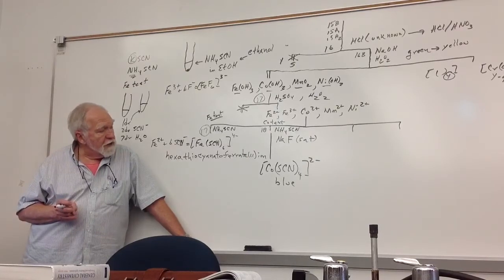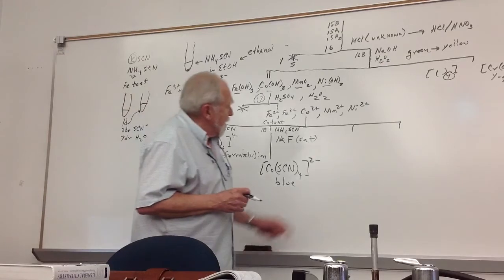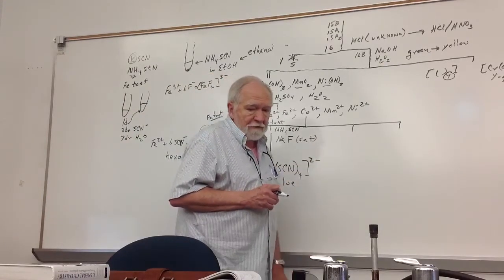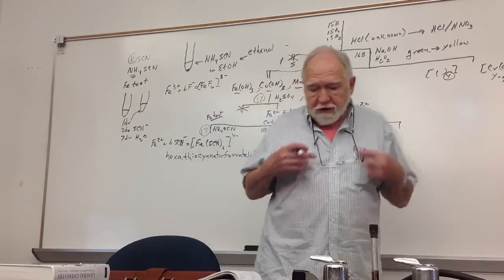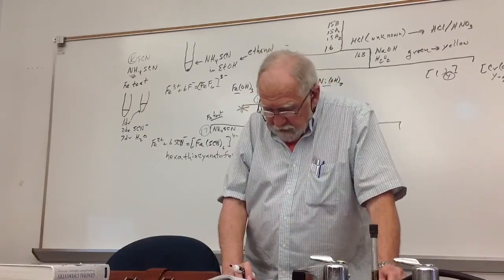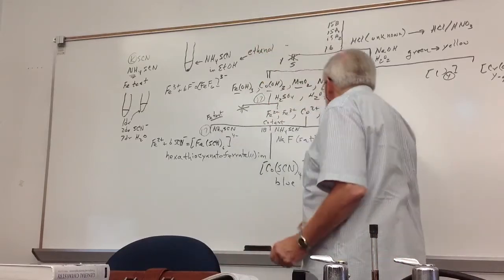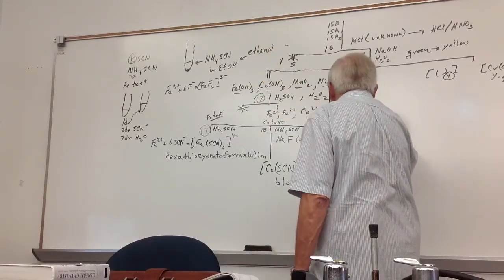Now you won't have anything to show me for cobalt, you will have something to show me for nickel. What I said is you're going to calculate the drops by dividing by 4. Now we're going to procedure 19 here. Okay. You want to first of all make sure it's basic. This is the nickel test.